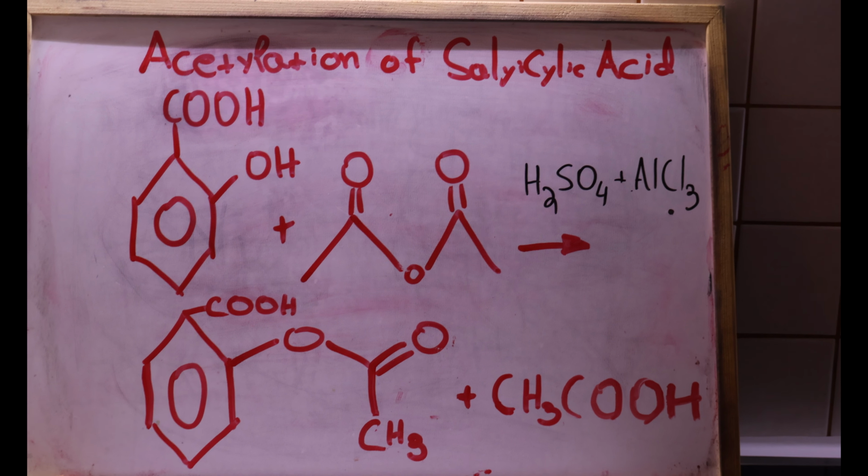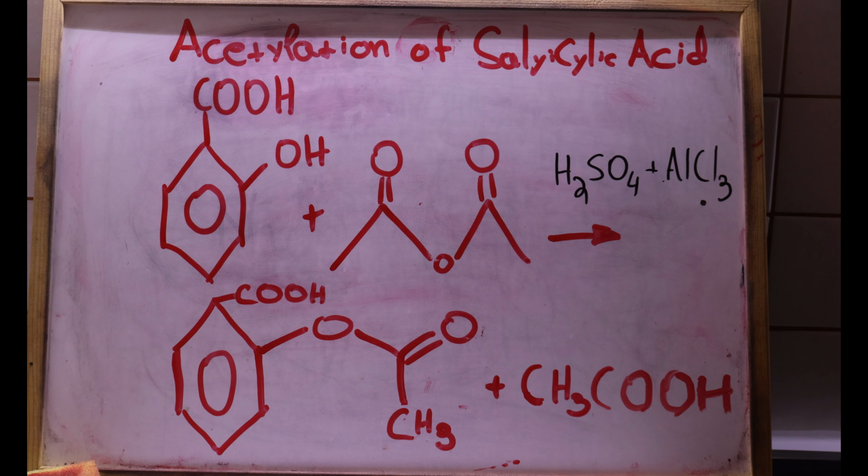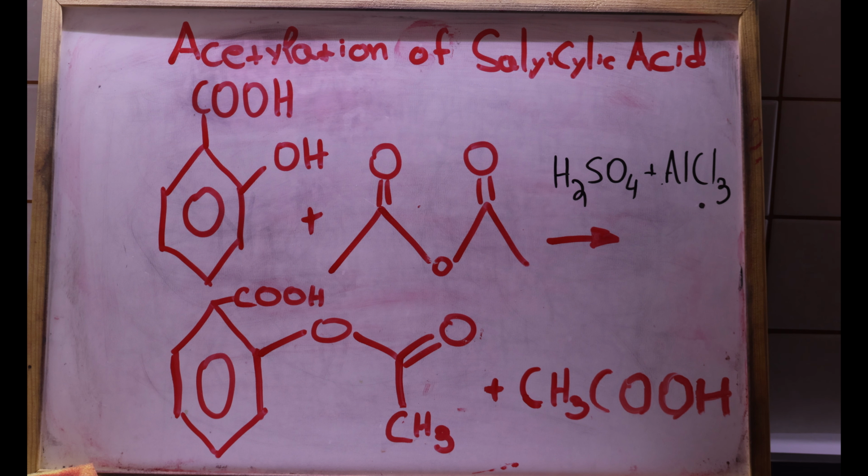Hello and welcome to Starboard Science. Today we will be acetylating salicylic acid and we will be making acetylsalicylic acid, also known as aspirin, the painkiller.